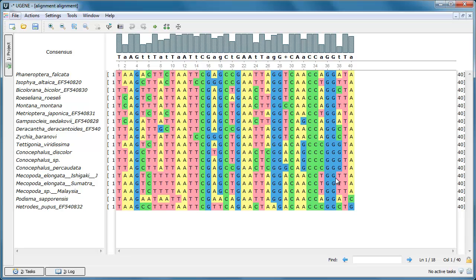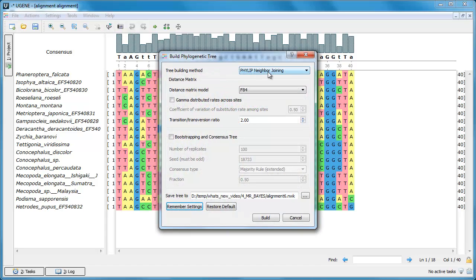The program Mr. Bayes, used for the Bayesian estimation of phylogeny, was added into UGENE as an external tool. To build a phylogenetic tree using the program, press the Build Tree button in the Alignment Editor and select the Mr. Bayes method.